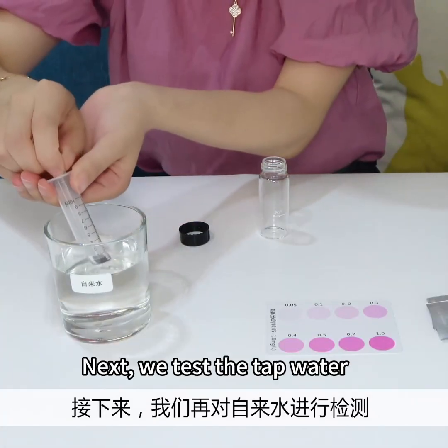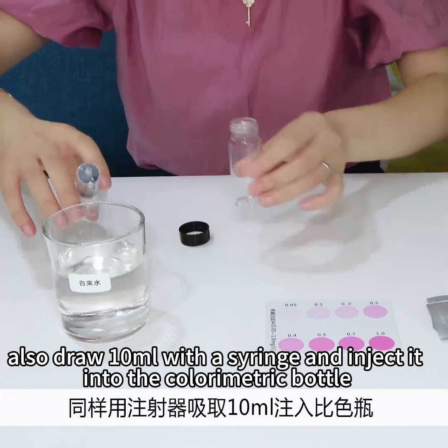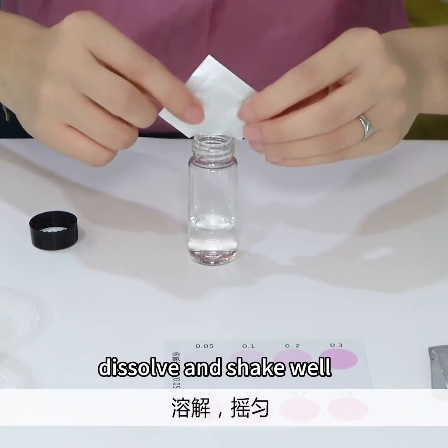Next, we test the tap water. Also draw 10 milliliters with a syringe and inject it into the colorimetric bottle, add one pack of residual chlorine reagent, dissolve and shake well.